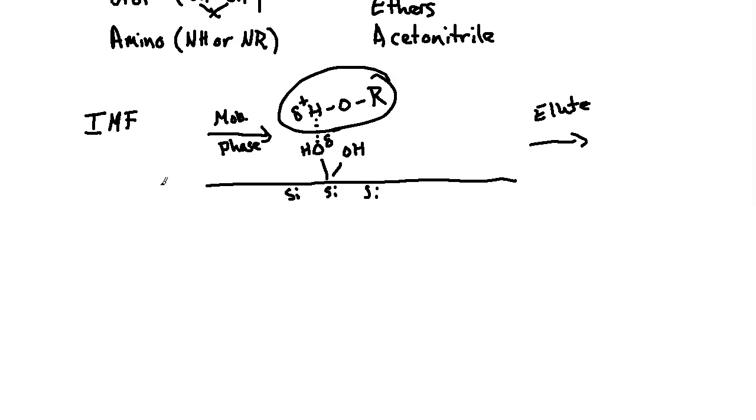It doesn't take 20-plus hours just to do a small run. But you also don't want to wash everything off of the column all at once and not get any separation at all by adding something too polar, like spiking it with 50% methanol or something like that. That's far more likely to be an appropriate mixture when you're talking about reverse phase HPLC instead of normal phase.